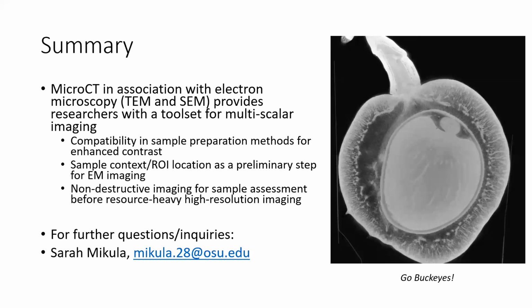Unless you want large scale context to show zooming in on whatever it is you want to image. But if you're not sure, it's a really good idea. And also the helioscan at CEMAS right now is quite cheap to use. So it's a nice use of resources.